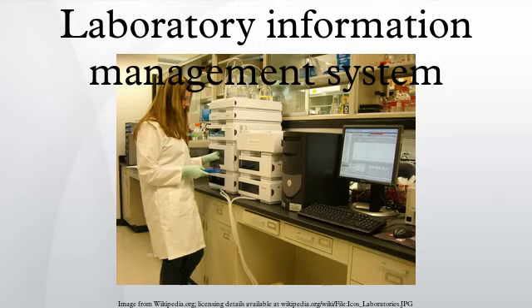The features and uses of LIMS have evolved over the years from simple sample tracking to an enterprise resource planning tool that manages multiple aspects of laboratory informatics. The definition of LIMS is somewhat controversial. LIMSs are dynamic because the modern laboratory's requirements are rapidly evolving and needs often vary significantly from lab to lab. Therefore, a working definition of LIMS ultimately depends on the interpretation by the individuals or groups involved.